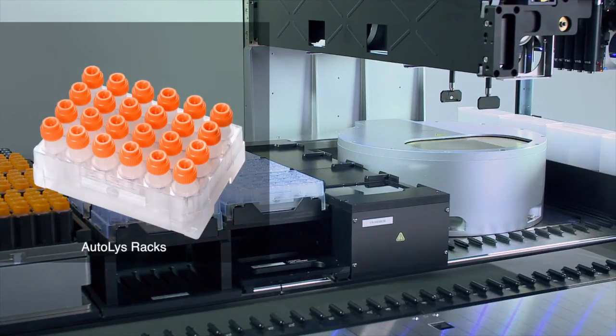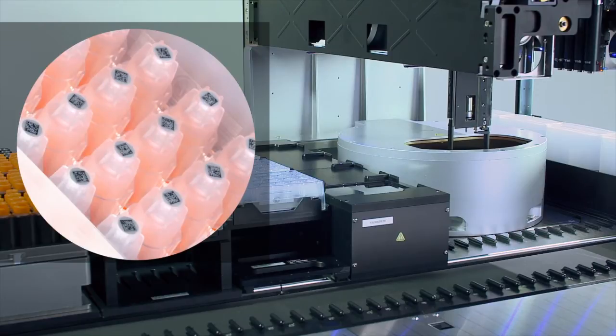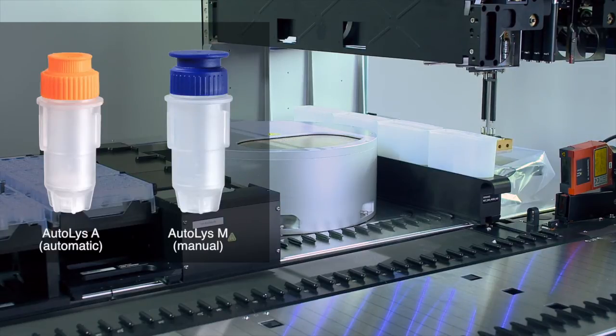To facilitate tube handling, a special Autolis rack is used, allowing handling of 24 tubes at a time. These Autolis racks are in SBS format, making them compatible with centrifuges and 2D barcode readers, as well as Hamilton automated storage systems. Autolis tubes also feature a special blue cap to facilitate easy manual handling for a manual workflow.